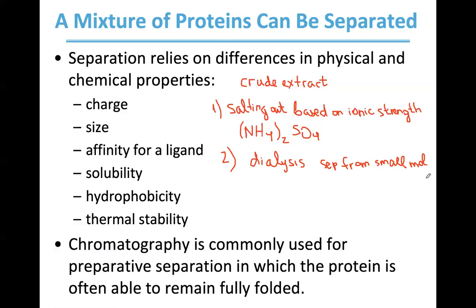So basically, you put the protein or mixture of proteins in a bag. Literally a bag with a semi-permeable membrane. The pores in the membrane will allow the small molecules to go in and out, but the proteins will stay inside because they're too large. They will not be able to pass through the pores.